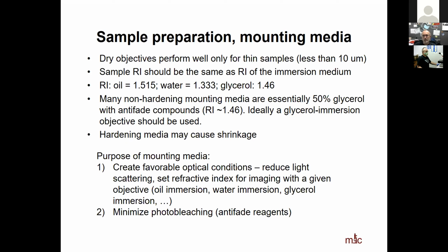Some media remain liquid, so you have to seal the cover glass so that it doesn't slide off or dry up. Other media are hardening media where you put the drop on and eventually it dries up, but then it also tends to shrink. So if you're looking at 3D images, you may get quite a bit of distortion.